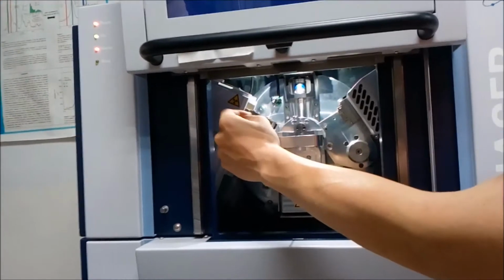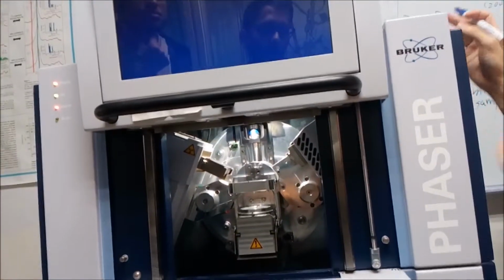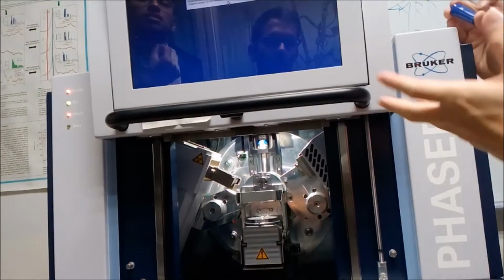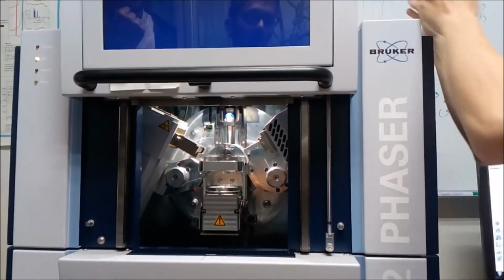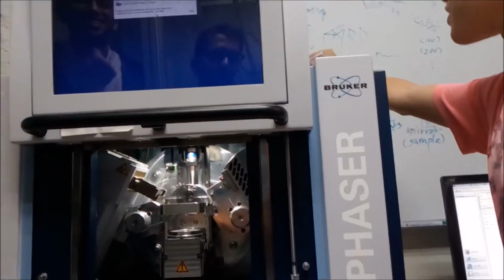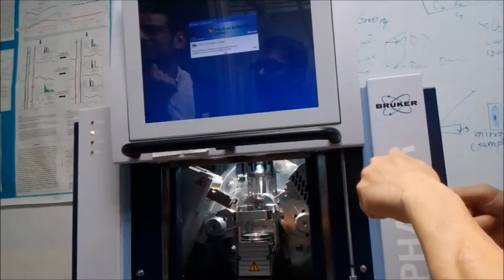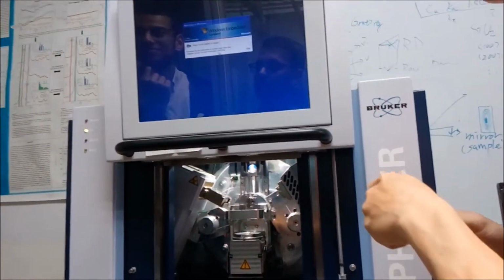But when the beam is injected into your sample, it will produce other K-alpha, K-beta, and other X-rays from the sample. So you need to get rid of the others, and you need to use the grating. So the grating eliminates the background from the sample, right? Yeah.